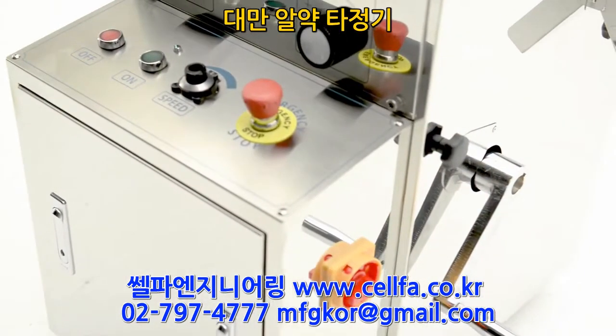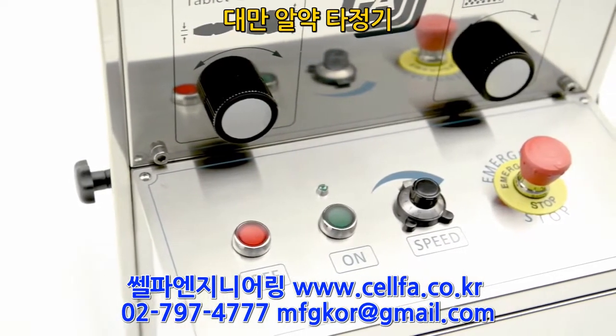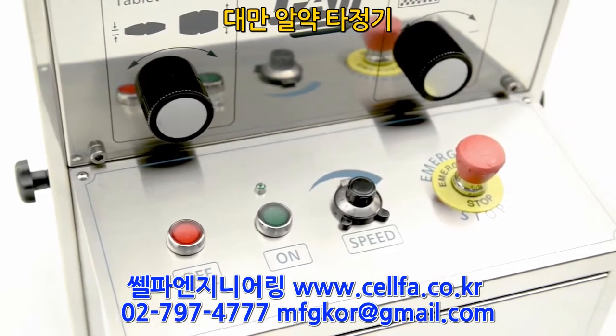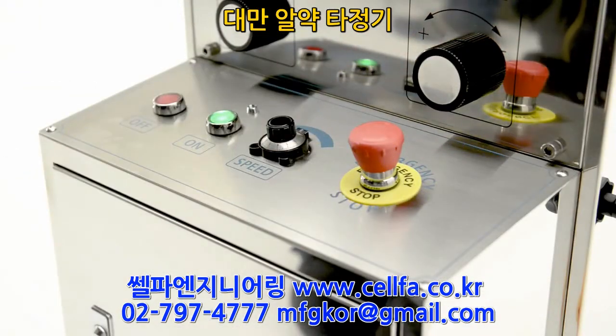Easy controls — the RTP-118 features fill depth and punch pressure adjustment, an on and off switch, as well as an emergency stop button. Also a speed control which will allow you to control the dwell time on your machine.